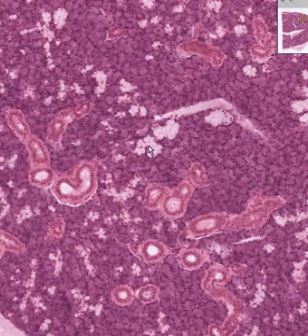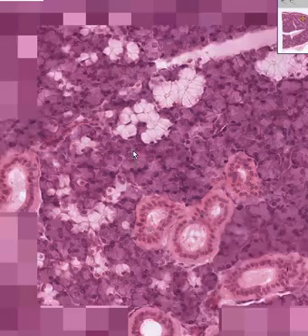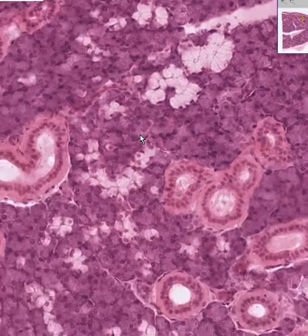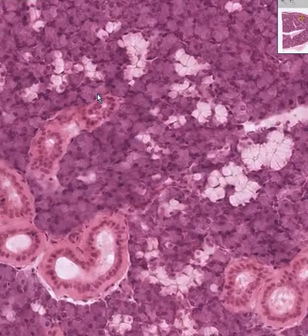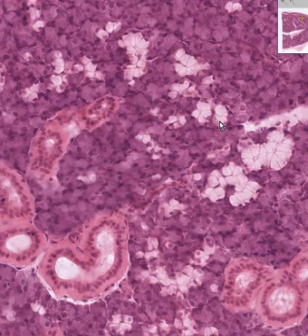And sometimes you'll get an acinus that's half serous and half mucinous, like perhaps over here. And if that was the case, you would call the serous portion a demilune, because frequently it looks like a little moon being displaced by these clearer, more mucinous cells.